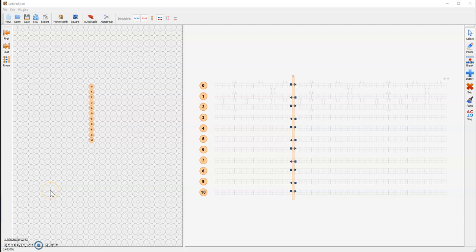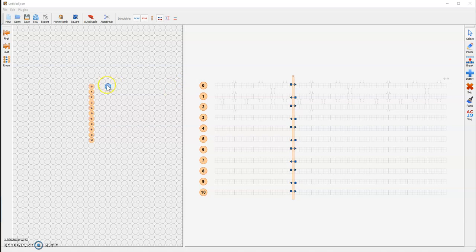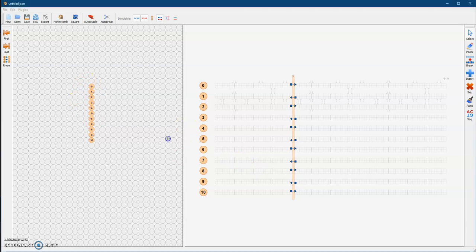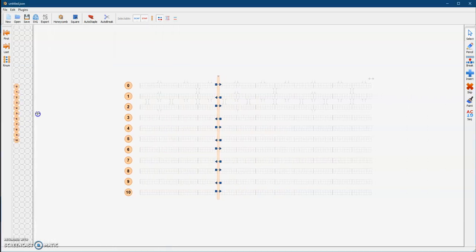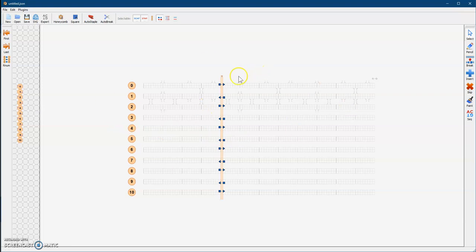Hello everyone, let's continue learning how to use caDNAno. What we're going to do today is create a simple 2D square. I got a little head start — I hit the square to get the square lattice and then double-clicked down in a straight line on these helices to make my bases here to get my strand started. Now that we're pretty much done with this window, I'm going to collapse it a bit to give more space to work with.